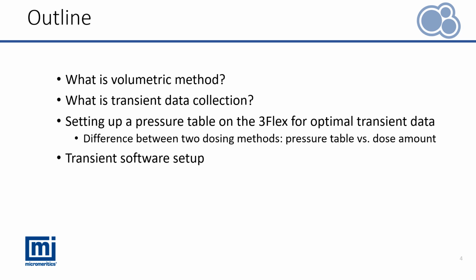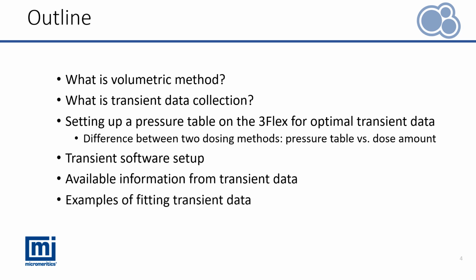And then we'll talk about what kind of information is available from this feature, as well as the new feature on the most updated transient data collecting software. And finally, I will provide some examples of fitting of the transient data from a published work as well as a recent collaboration, which calculates the diffusion coefficient in the end. However, the actual fitting of the data is beyond the scope of this webinar, which involves in-depth understanding about the material of a sample and usually a set of Python scripts for the fitting.